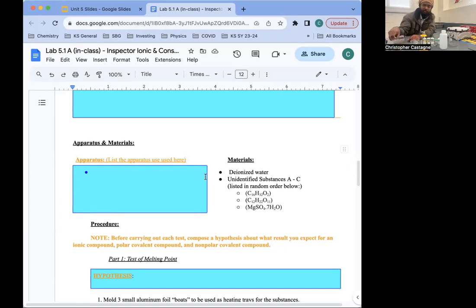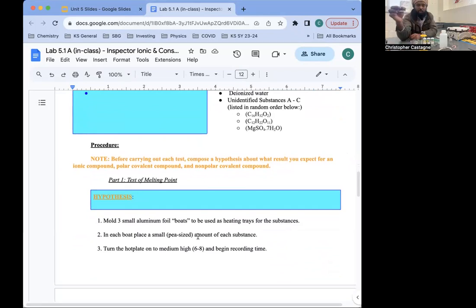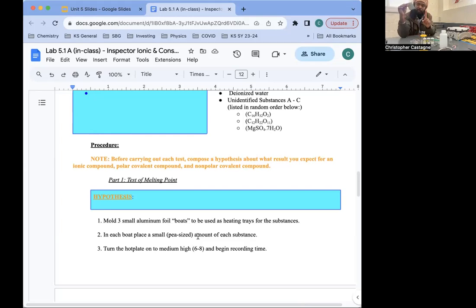The first test is the test of melting points. What we're going to do is mold small pieces of aluminum foil into boats — just put some sides on it so that when the substance melts, it doesn't run all the way out. Thinking about variables: in any experiment, you have to have one independent variable, which means your input, what is changing each time. For this one, that would be the substance — it's different each time.